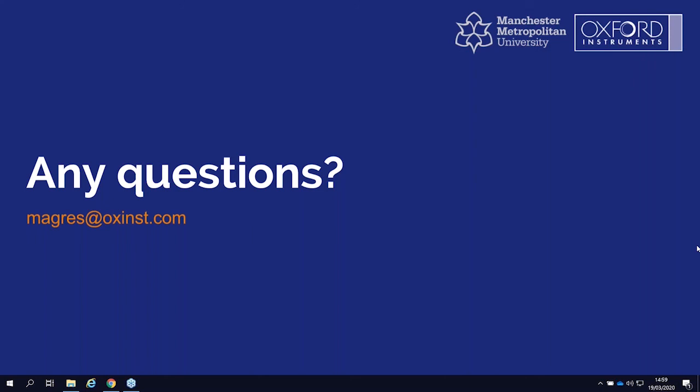As Ryan rightly says, the temperature of the magnet is actually a little bit warmer than that, somewhere about 40 degrees, but the heating effect is minimal.